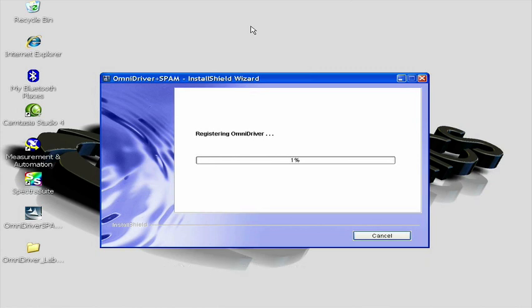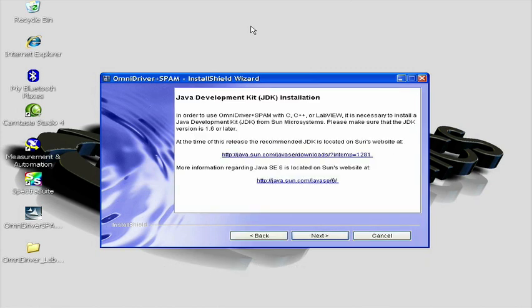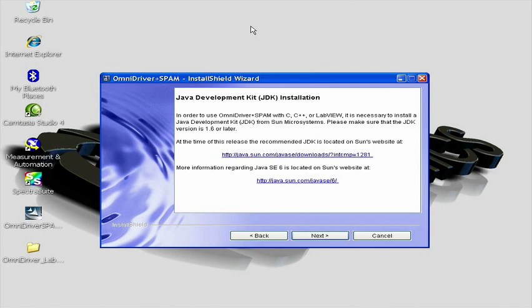After the installation has completed, the next screen will indicate that you need to have a JDK of 1.6 or higher installed on your PC for Omni Driver to function correctly. If you need to install a JDK at this time, you can click on the hyperlinks provided on this screen. Finally, click Next to proceed to the next screen.